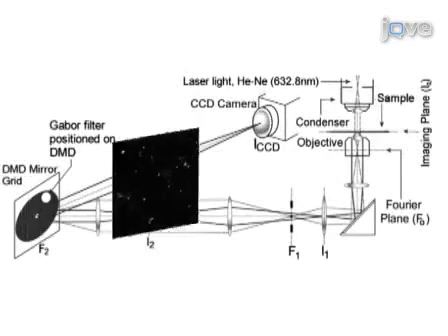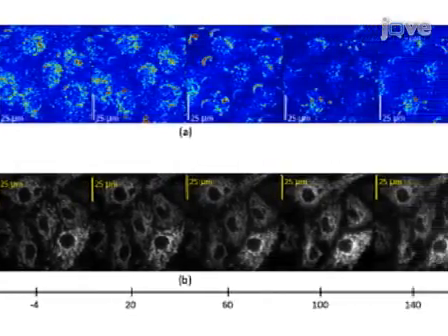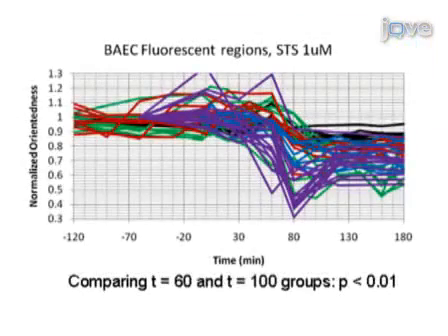Optical data are acquired to detect changes in the orientation of cellular organelles. Within 2 hours, the onset of mitochondrial fragmentation can be measured using the optical scatter data, which shows a decrease in the degree of orientation of subcellular particles. The data are then validated by correlating the optical scatter data with the fluorescent regions containing mitochondria.